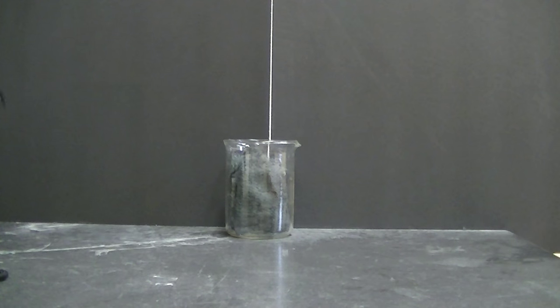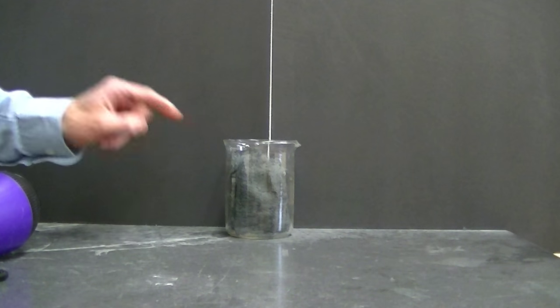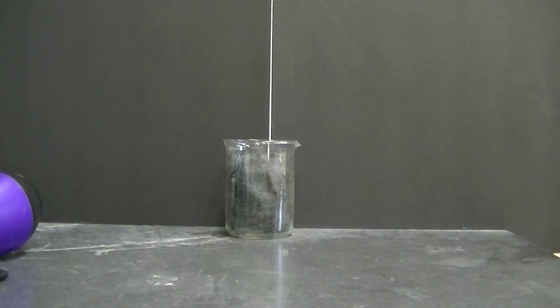All right. The beaker is now quite hot, so don't handle this with your hands. You're going to need tongs to take it to the balance. At this point, though, it's instructive to ask your students, do you think the mass of the steel wool has gone up, has gone down, or has it remained the same? Let's take it to the balance and find out.